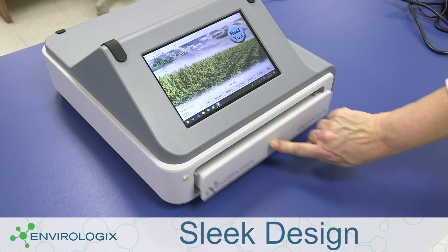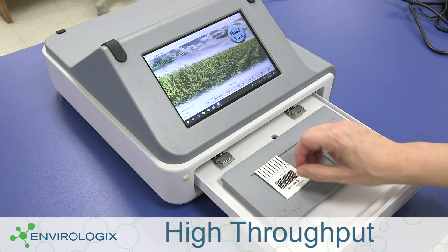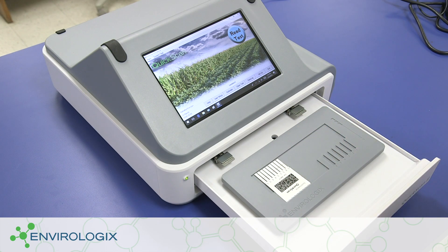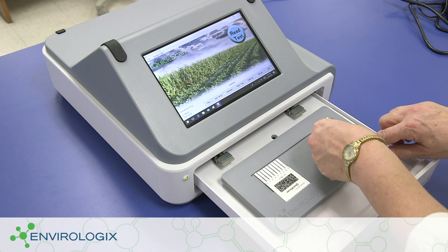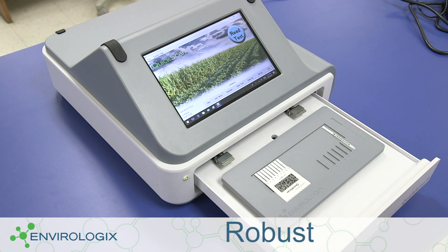The drawer that holds the combs and strips has improved recesses for easier loading and expanded capacity. The scanner orientation is improved, offering faster reading times and fewer opportunities to accumulate debris, which means less cleaning for you.